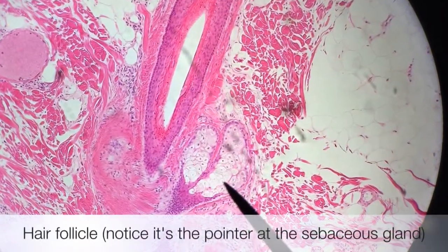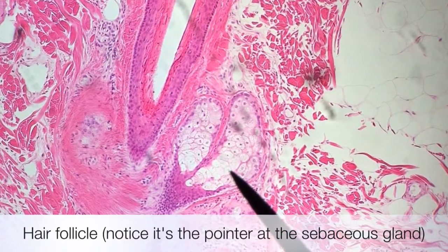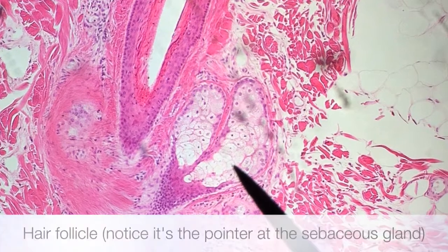Now this is a picture of a hair follicle, and if you look closely at the pointer, you can see that it's pointing at the sebaceous gland.